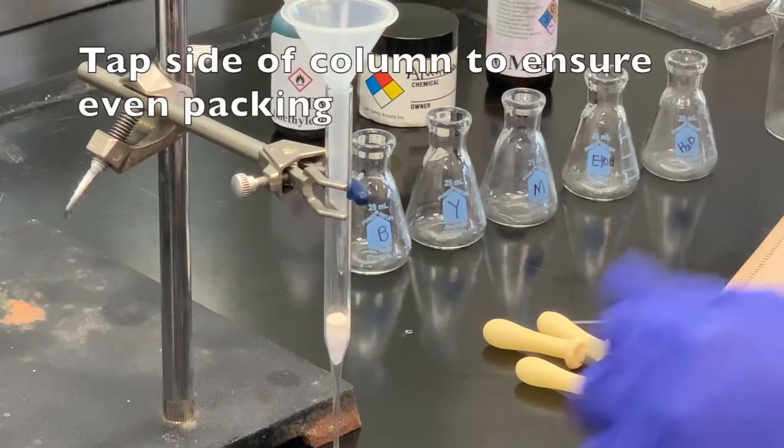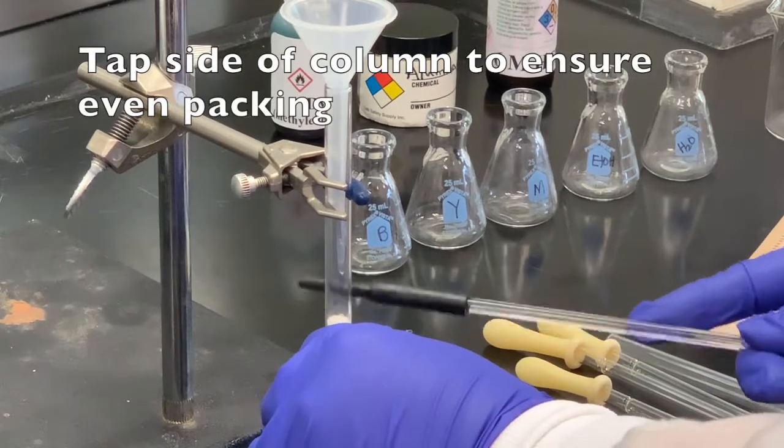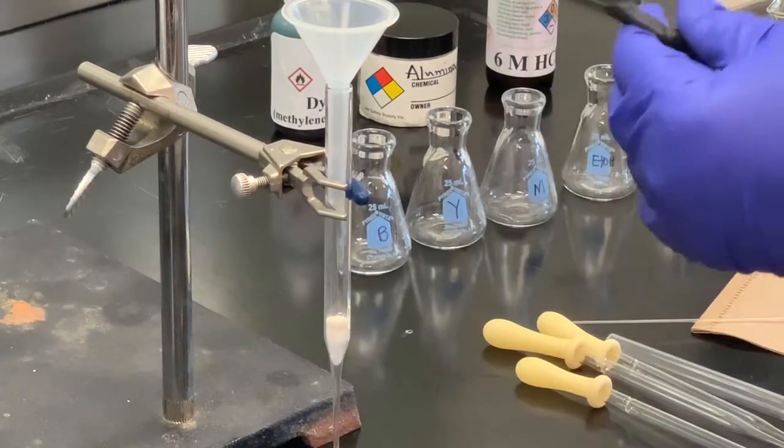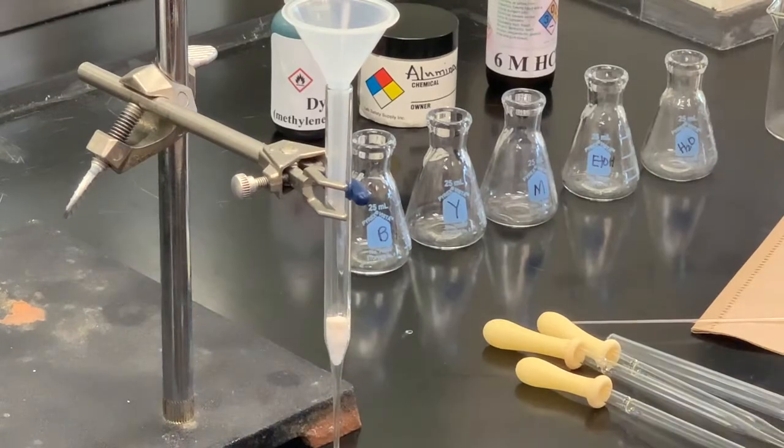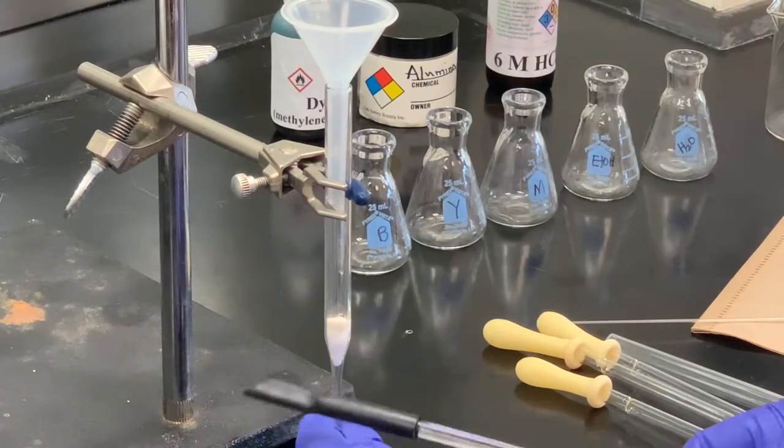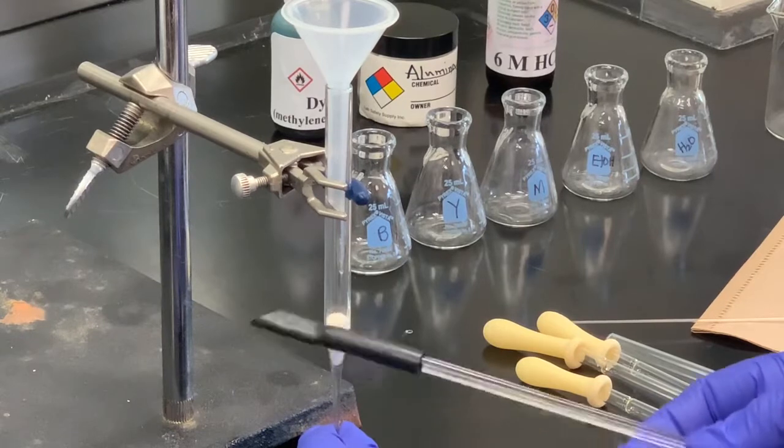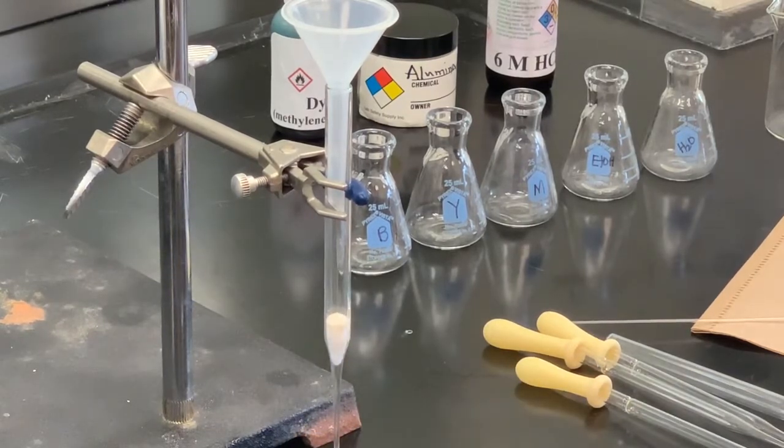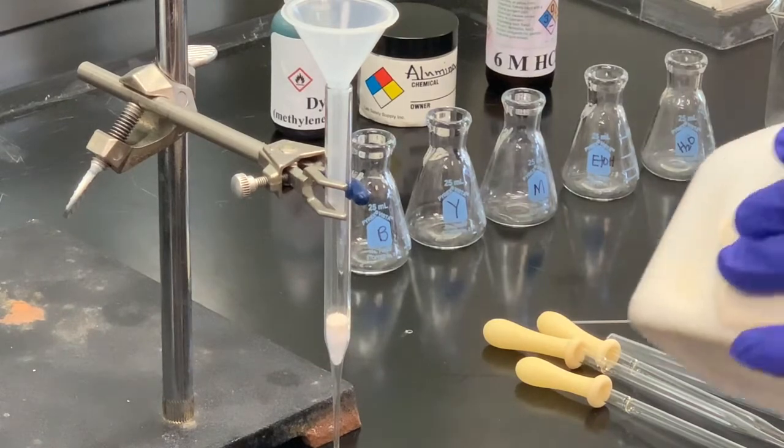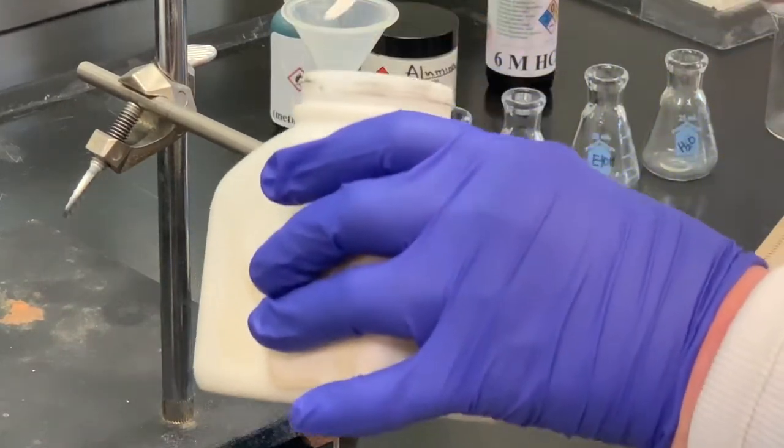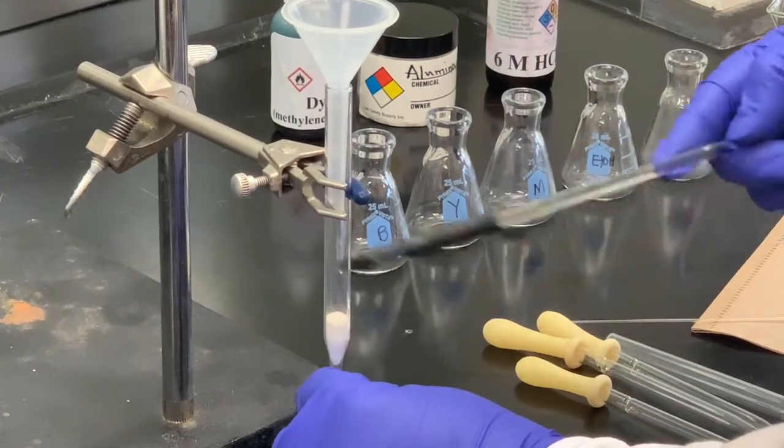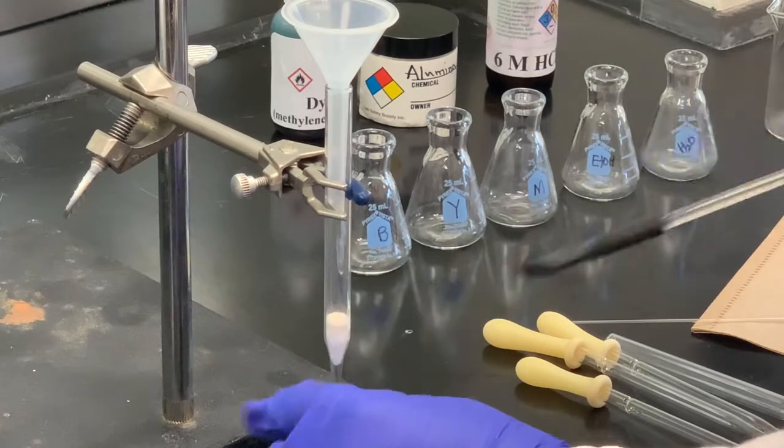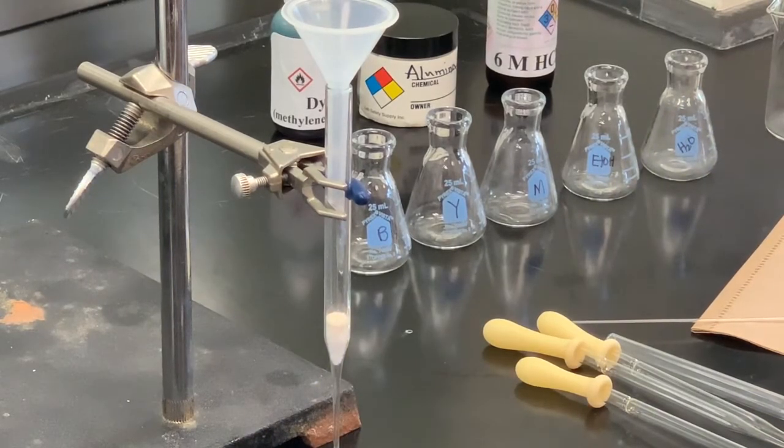And every time we add something, we want to give it a tap. I'm using the rubber policeman on a stirring rod. You could certainly use a piece of rubber tubing. And we just want to make sure that's a little more level. And I think I'm going to add just a little bit more sand. I think that looks pretty good. I'll leave that as it is.